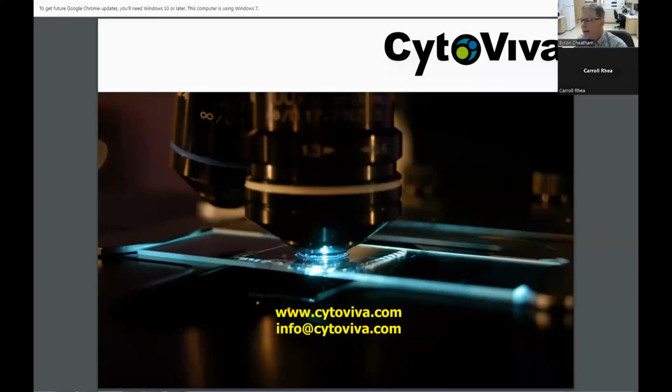But with respect to the antibiotic resistance of the pathogenic clinical isolates, you can understand how the carbon dots are interacting with the pathogen. And Dr. T. Pradeep at IIT Madras has published papers looking at silver nanoparticles and how the leaching of the silver into the solution, or the nanoparticle itself, can cause membrane lysing of the antibiotic resistant pathogen. Okay.